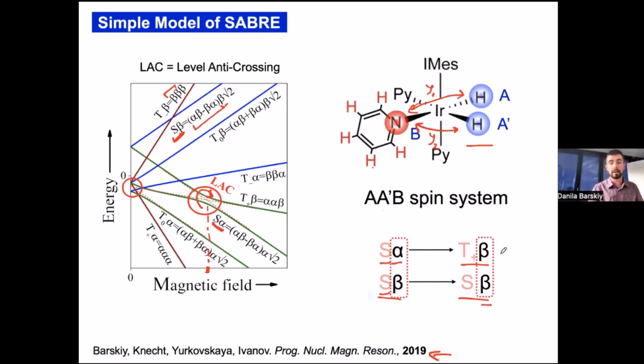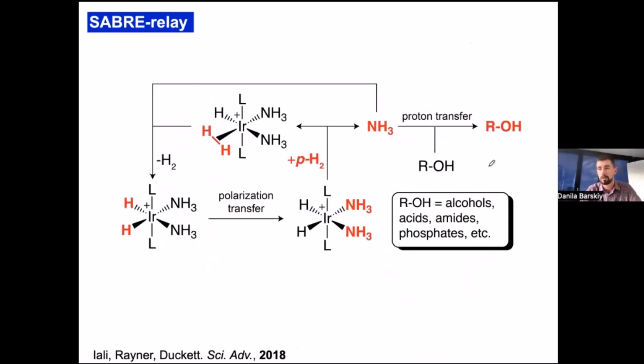So in the ideal case, actually, from one mole of parahydrogen molecules, you can in principle obtain one mole of hyperpolarized material. In reality, it's always more complex. You have relaxation processes, you have other dissipation processes in the system, and you obtain lower polarization levels. However, indeed, we are at the level when we can obtain levels of 10, 20, 30%, sometimes routinely inside our benchtop NMR spectrometers. So I think with this technology, we are very easily talking about very large polarization values on the order of unity.